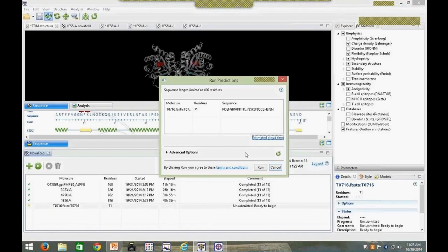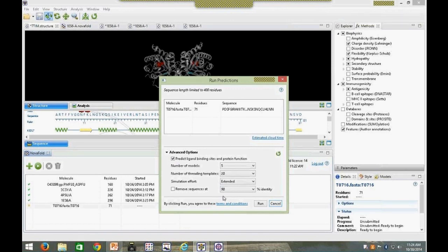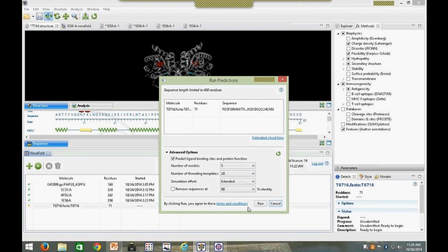NovaFold doesn't provide exact cloud processing time, but we can estimate based on number of residues. Selecting the estimated cloud time link brings us to the NovaFold benchmarks page on our website. For small proteins of about 100 residues or less, the prediction takes just hours. For larger proteins, some may take a day or two. The Advanced Options panel lets you configure parameters for the prediction. One important item is the ability to predict ligand binding sites and protein function — unchecking this box will cut down on prediction time if you don't need that information.